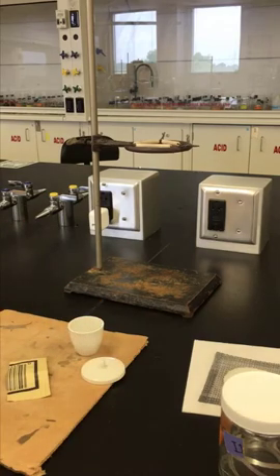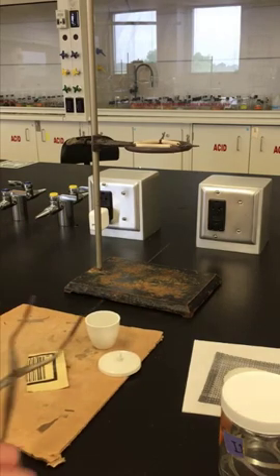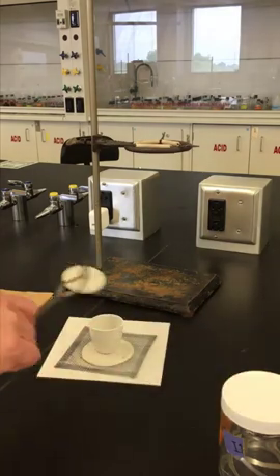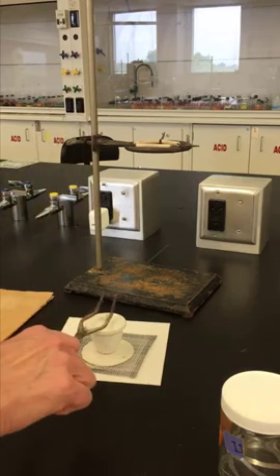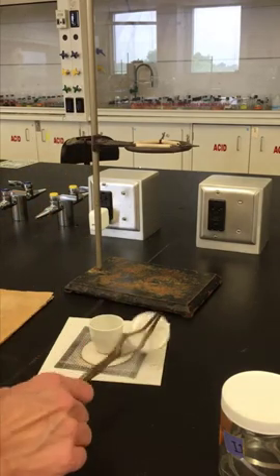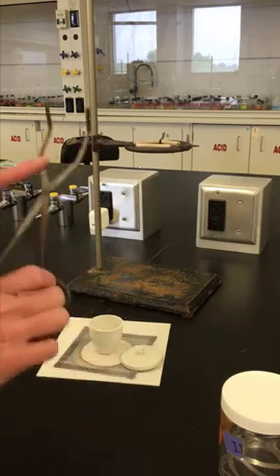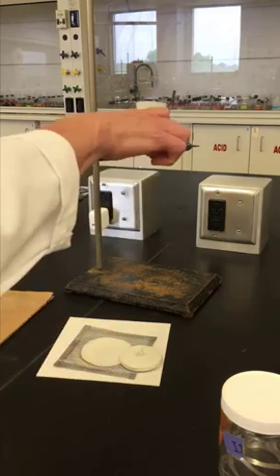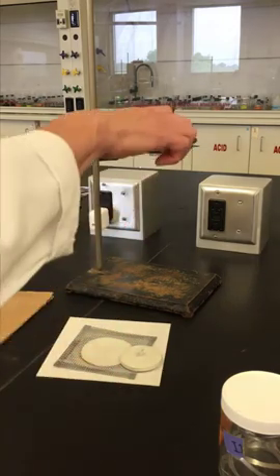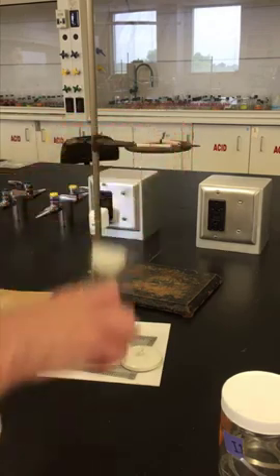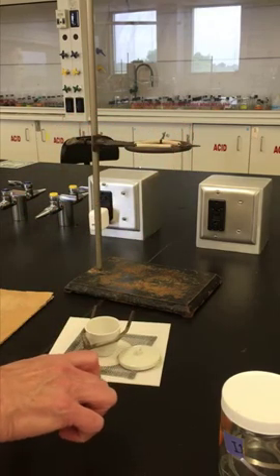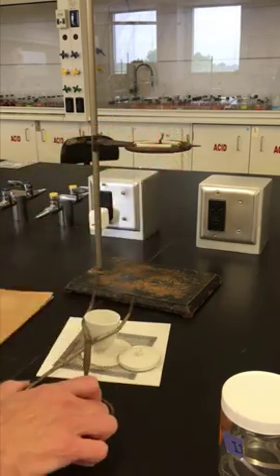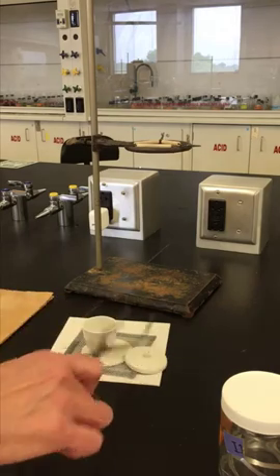Now the crucible and the crucible cover here, in case when it's hot, you need to practice with your crucible tongs about taking off the lid, taking the crucible so the crucible fits inside this area here, taking the crucible and being able to move it up to our clay triangle and off the clay triangle. So you want to be able to move it up and off and then the lid will go on and so forth.